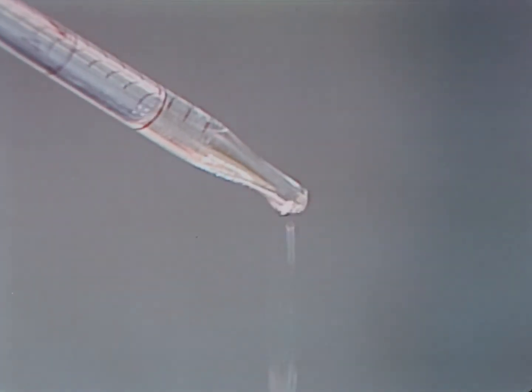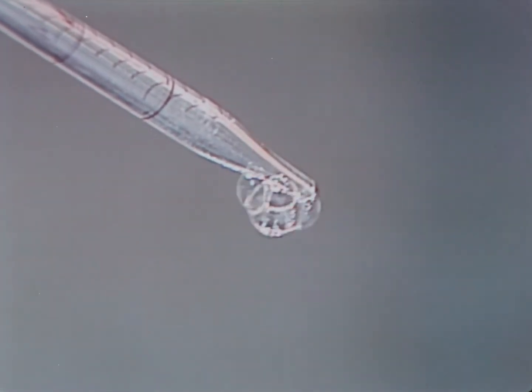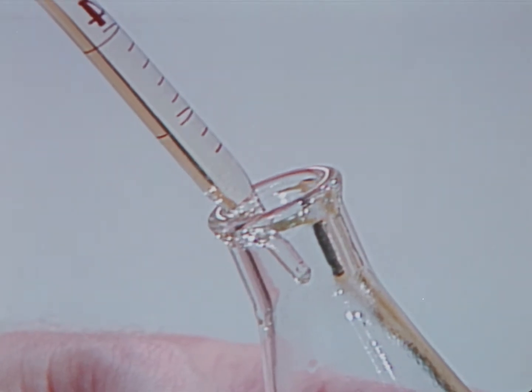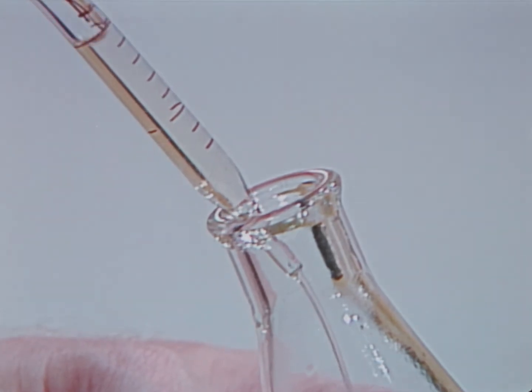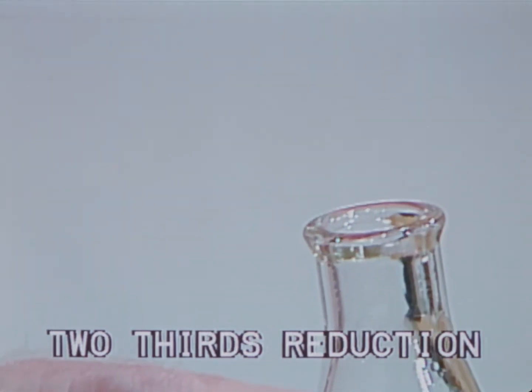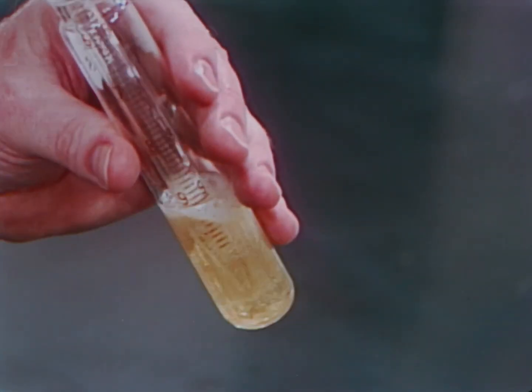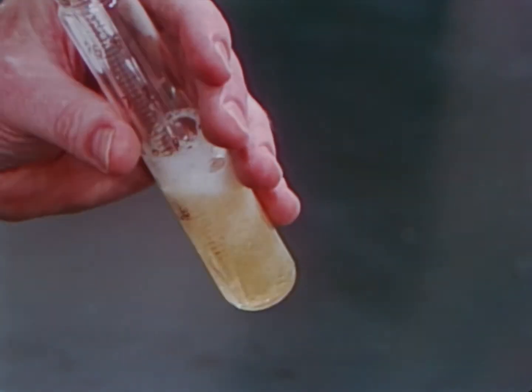Infectious aerosols also result from the improper use of pipettes. When the last drop is forcibly expelled from a pipette, the bursting bubble generates a dangerous aerosol. To minimize this problem, drain contents from the pipette by gravity flow. This reduces aerosol production by as much as 2/3. The pipette is frequently used to mix culture suspensions in a tube. This often results in aerosol-generating bubbles forming at the liquid surface.